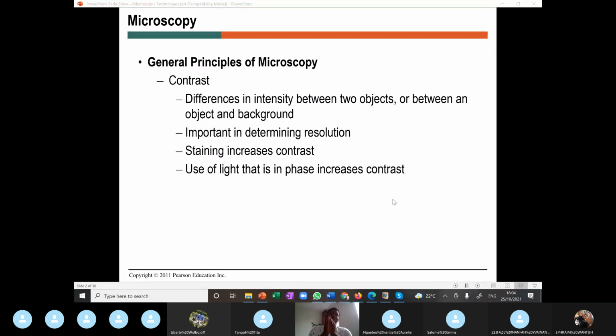So basically we have the microscope that will have a lens. We may have a single lens in a simple microscope. We may have two different lenses or more in compound microscopes, and the most sophisticated microscopes, like our electron microscope, have more embedded lenses to produce a more magnified object. So thanks to the contrasting ability of a microscope, thanks to the different lenses, I'm sure you have some basic knowledge of physics, and you know that a lens magnifies an object.